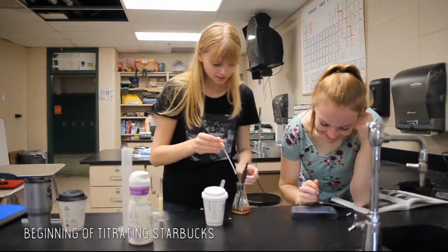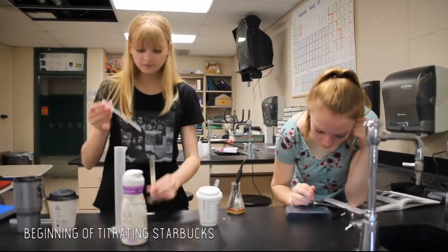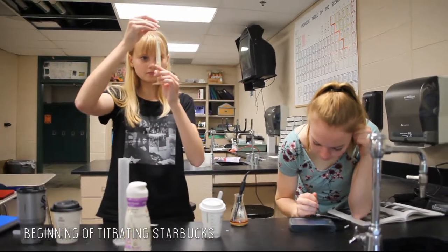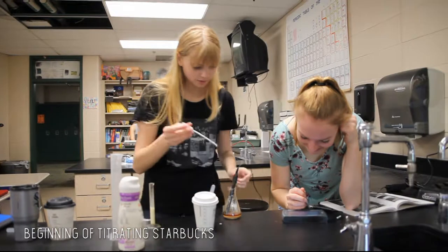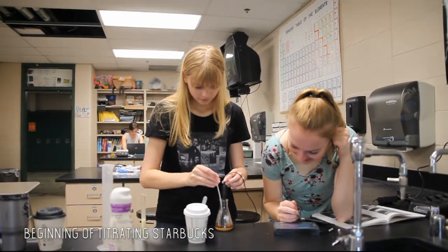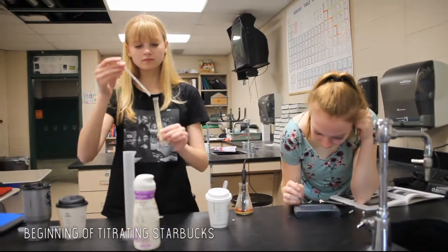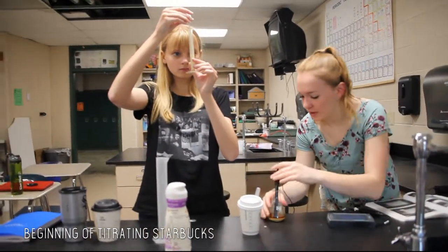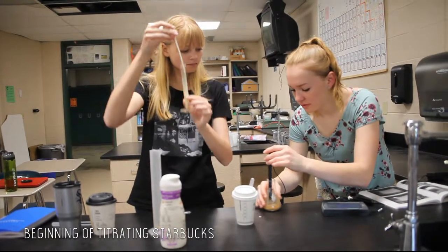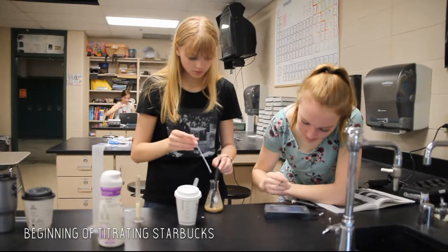Next, we poured creamer into a 10 milliliter graduated cylinder all the way up to the 10 milliliter mark, but since we used 12 milliliters of creamer for each titration, we had to refill the graduated cylinder once per titration. A mini pipette was used to draw out and drop creamer into the Erlenmeyer flask, one milliliter at a time, and the LabQuest was used to record the pH after each subsequent drop. We also swirled the flask from time to time to make sure the creamer was spread throughout the solution.